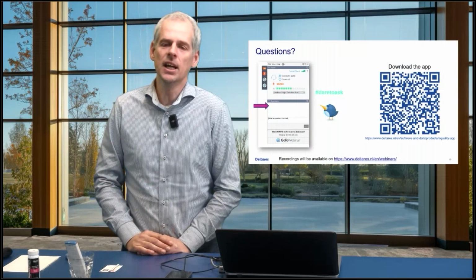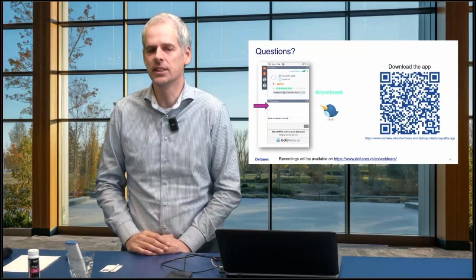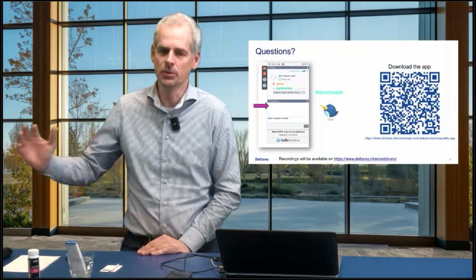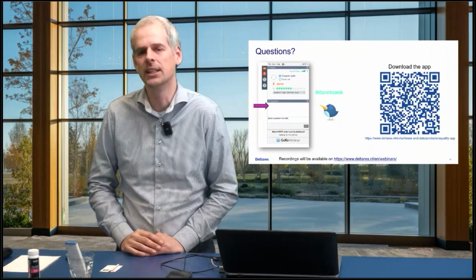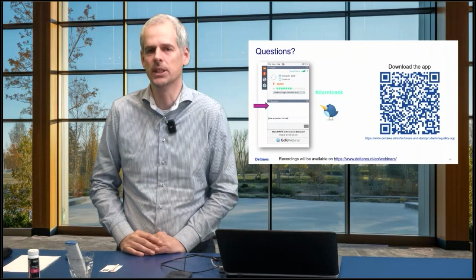The HANA checkers for ammonium and phosphate, they go in different ranges. So you can check their availability. They have a very low range, but also a somewhat higher range. So you can also check there, okay, what range of values do I expect in my area, and what device matches best with that range.